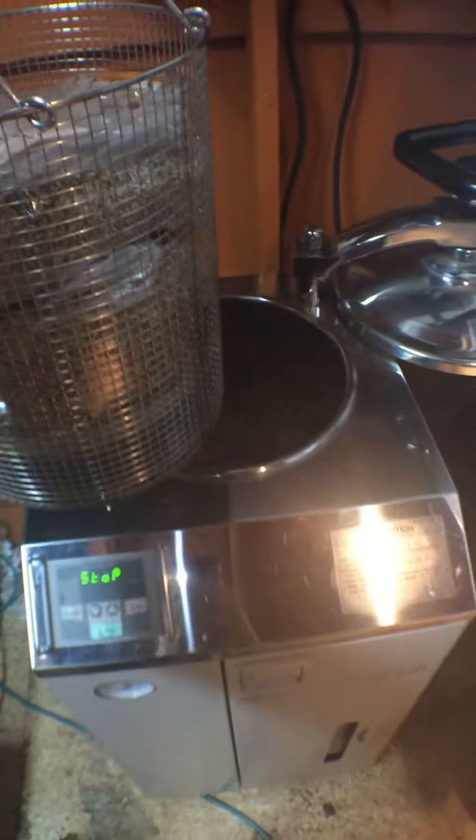We're reading the readout here — it's at stop right now. So that's 120 degrees for an hour and 45 minutes. We're going to press OK, and it's starting to sterilize. It's at 39 degrees Celsius right now.